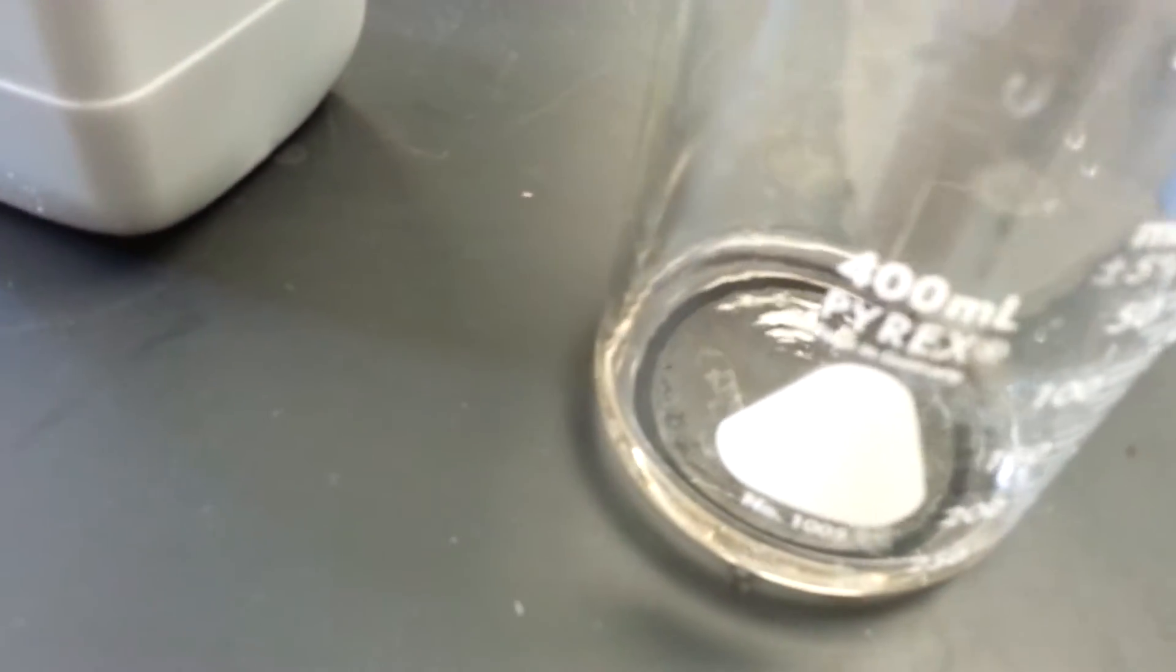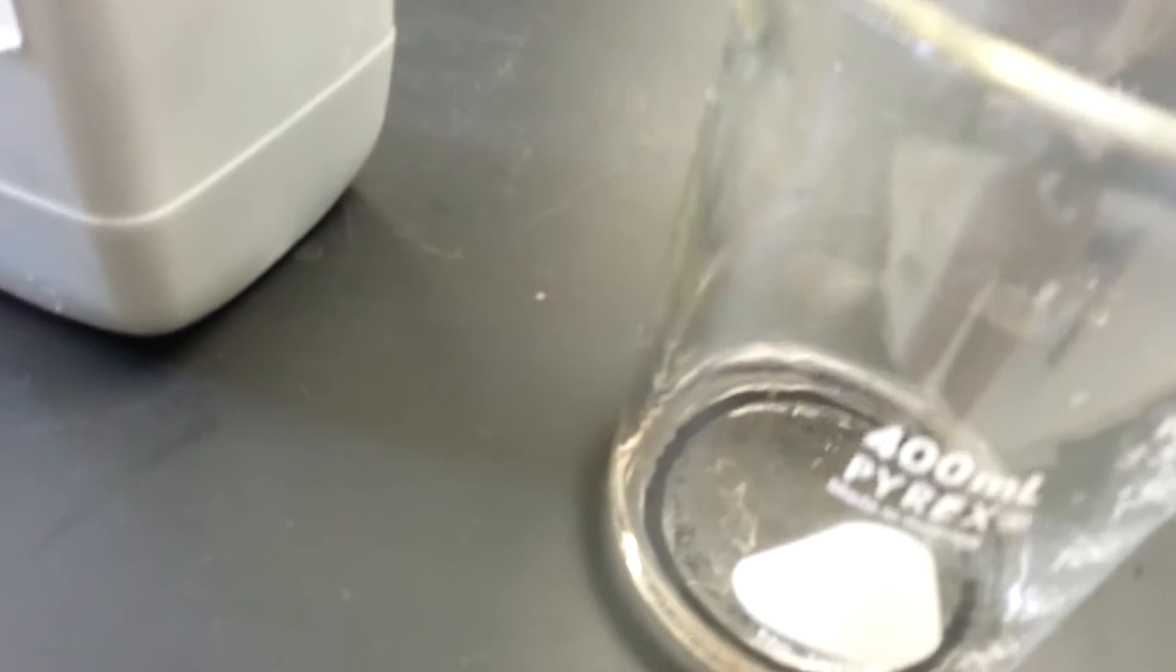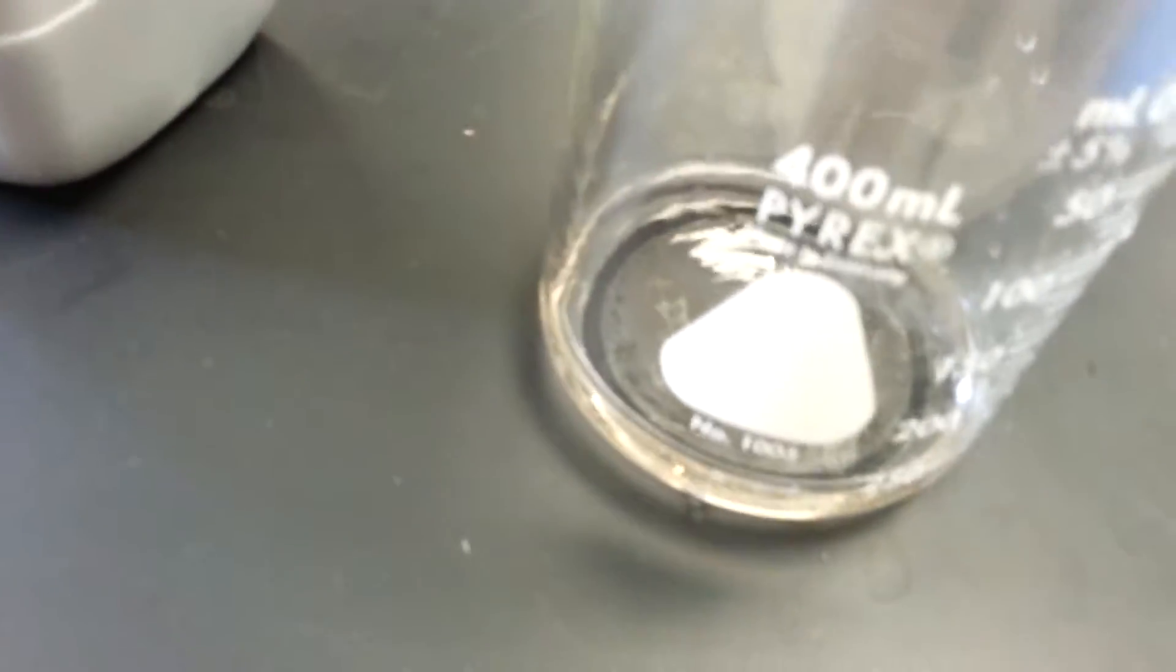The reason why you have to neutralize your acids and bases is that you cannot pour them down the drain. As long as it's neutralized, most of them you can. Let's see what happens when you add sodium bicarbonate to sulfuric acid.